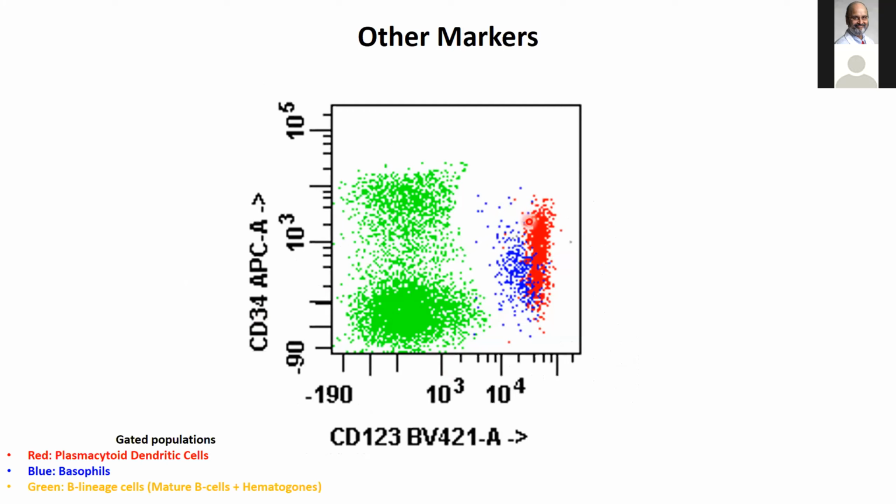Okay, and then lastly, it's really important to recognize, specifically in the plasmacytoid dendritic cell population, that you do have immature plasmacytoid dendritic cells that will be CD34 positive, and those will show up if you're doing any kind of minimal residual disease type of analysis. You're going to see these guys show up quite frequently, and even in a routine analysis, we look at 100,000 events basically, and we routinely see these CD34 positive plasmacytoid dendritic cells. So it's just real important to recognize that they do exist.